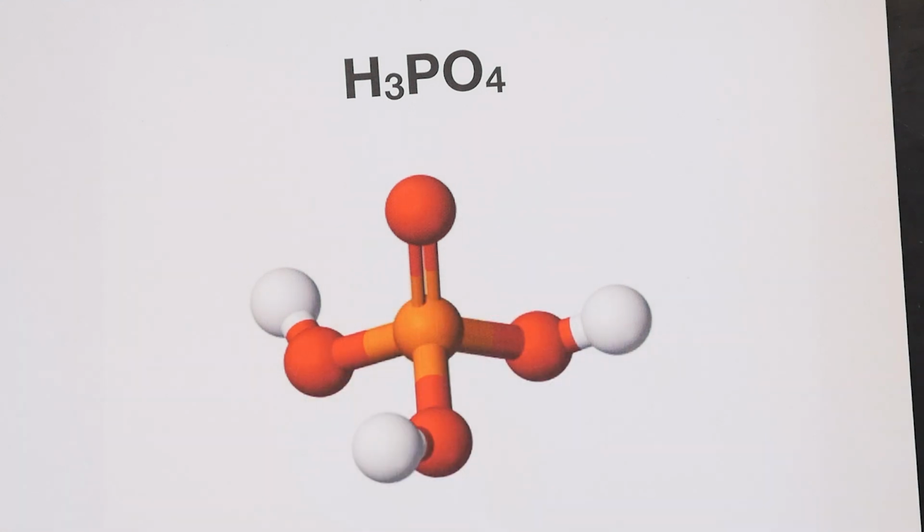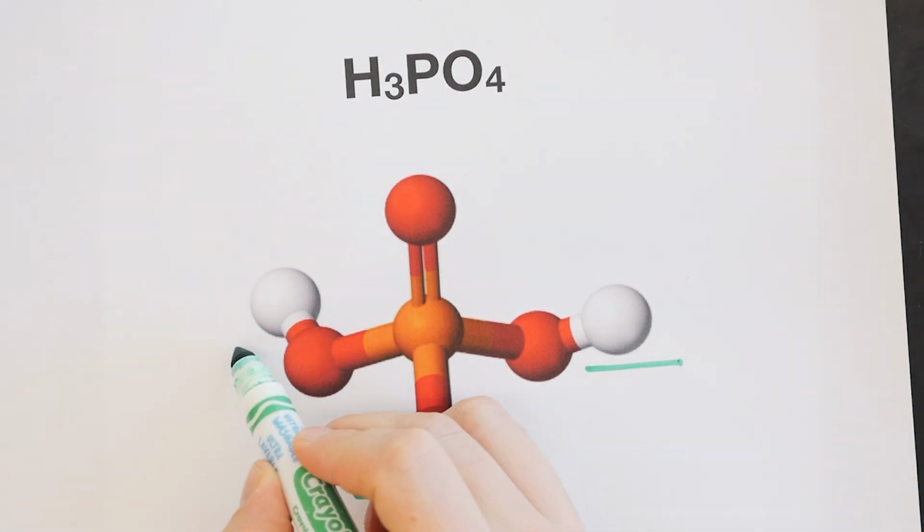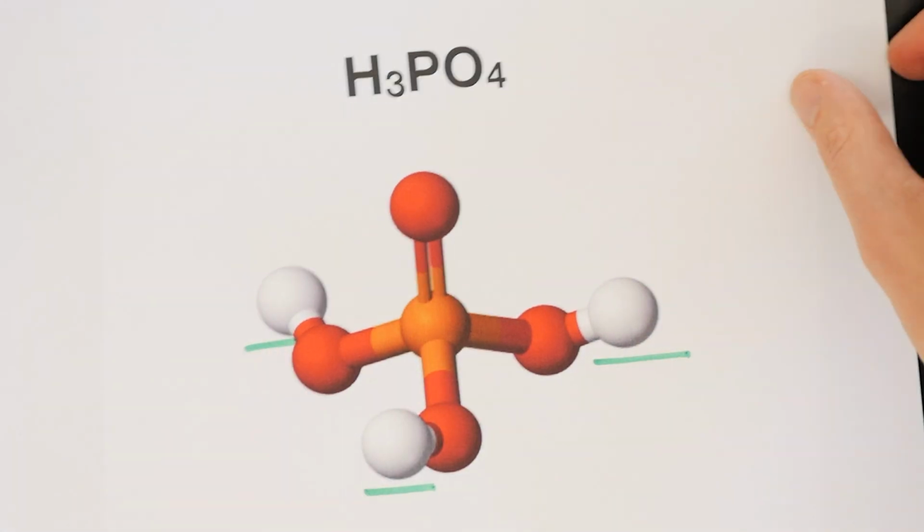In today's lab, we'll essentially be measuring the strength of a weak acid, except it's a really interesting weak acid that actually has several protons to give up. Or in other words, we say that it is polyprotic. Phosphoric acid actually has 3 different protons it can give up as an acid.